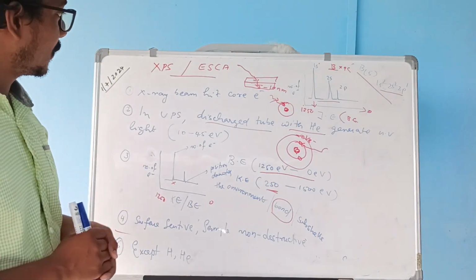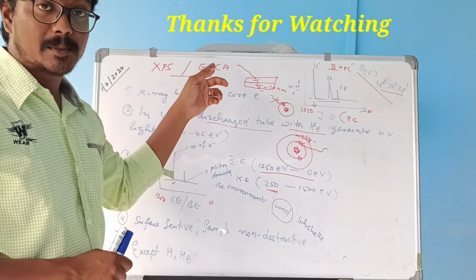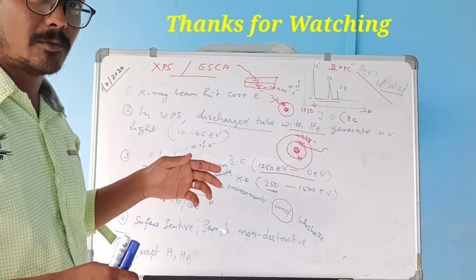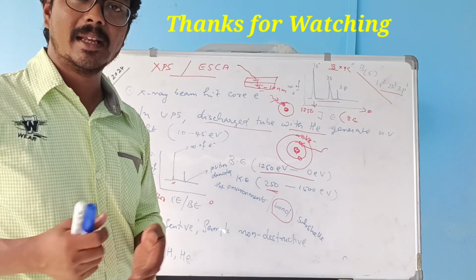So XPS, or ESCA, electron spectroscopy for chemical analysis, is one of the very important spectral analysis techniques used widely in the research area.